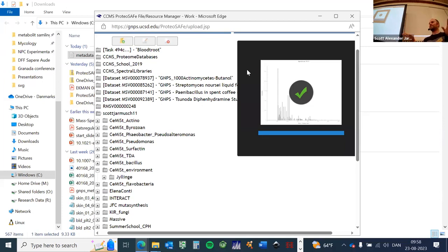All right. Can I see some hands of who managed to upload their files? Nice. Okay, who still struggles with uploading their files? All right, then I think we're going to walk around and help you. And then I think Scott can finish the job submission before we then talk a little bit about the background, what's going on under the hood while this job is processing.